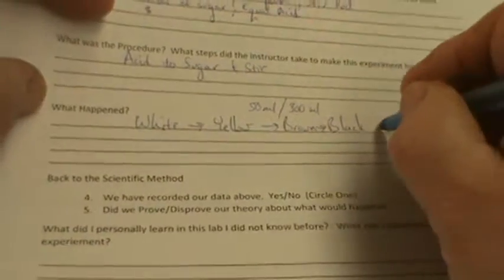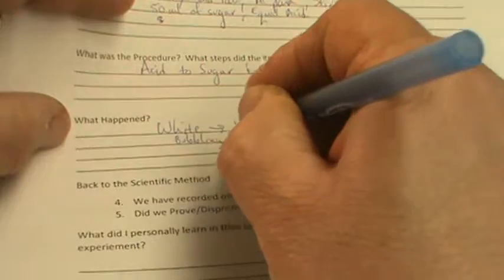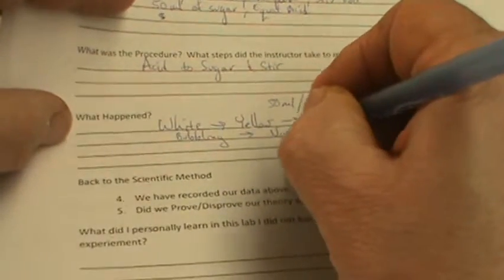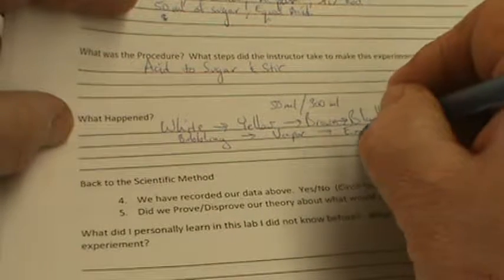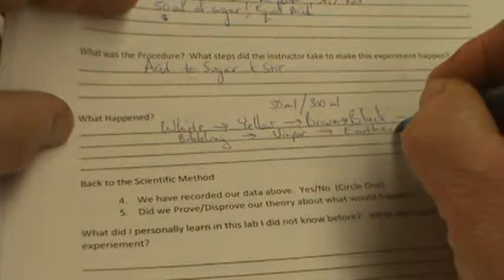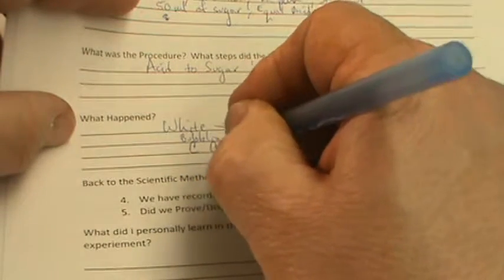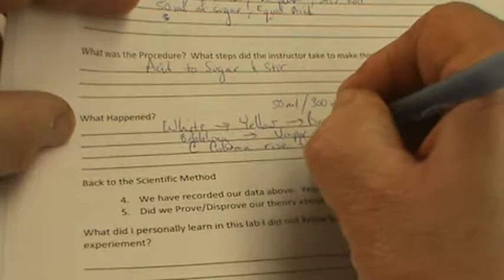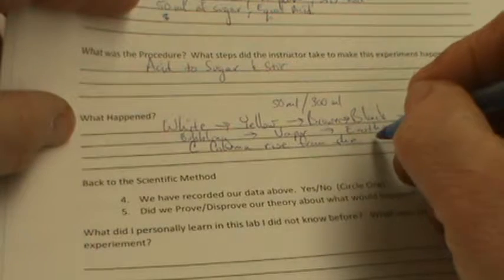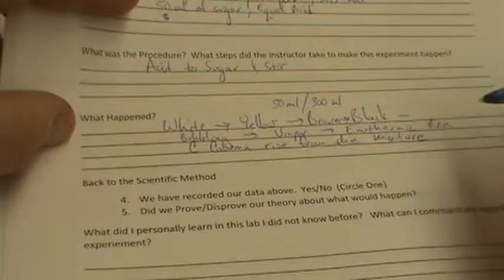So it goes to black, then we'll get some bubbling. And then we're going to get vapor. As we get the vapor, we're going to get our exothermic reaction, and we're going to have a carbon column rise from the mixture. I wanted to say goop. I don't want to say goop. I want to say mixture. I want to keep it scientific.